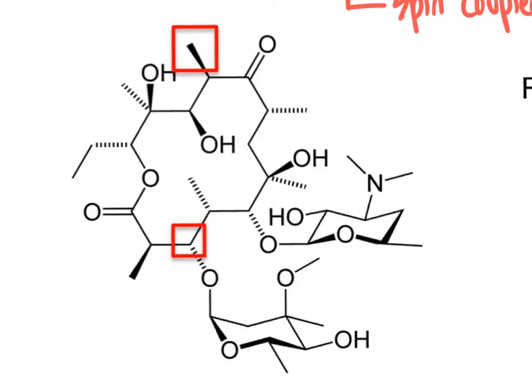And looking at what we have here, I'm going to start with the methyl group, and I'm going to go ahead and fill in. This is a CH3. Now, when we think about the CH3, we expect that that methyl group, the 3 protons there, will show up as a single signal in the NMR spectrum because it's connected through a single bond to the rest of the molecule, not a double bond. This is not part of a ring.